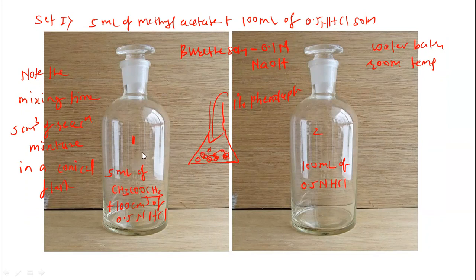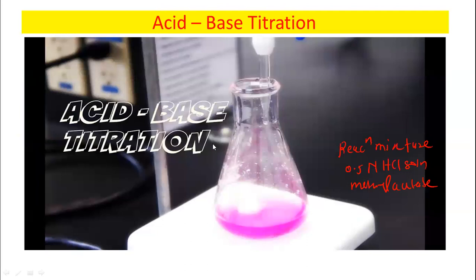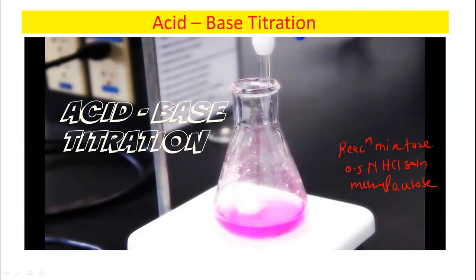So we have to titrate this solution with sodium hydroxide solution from the burette. The concentration of the sodium hydroxide solution is 0.1 normal.